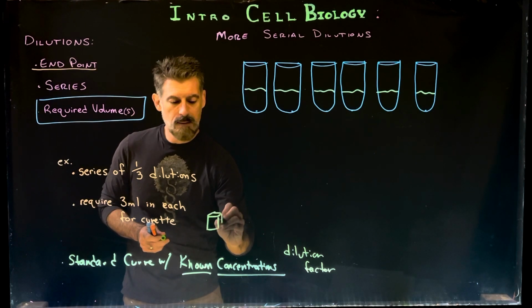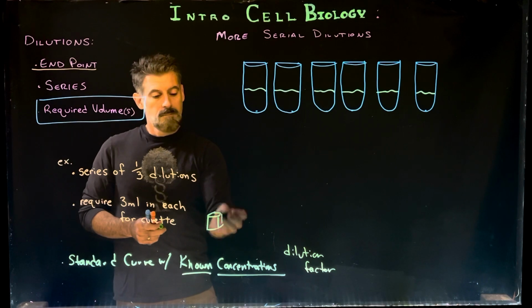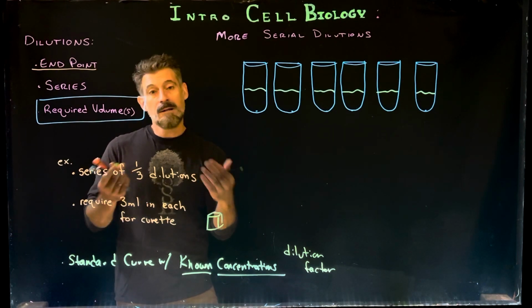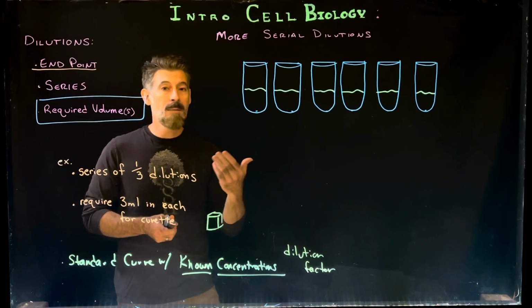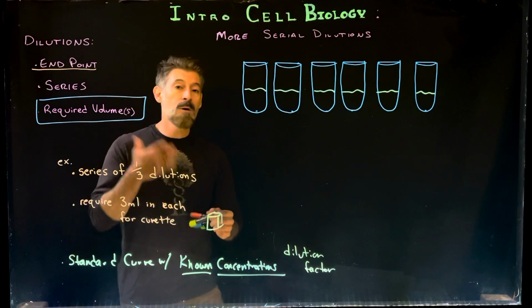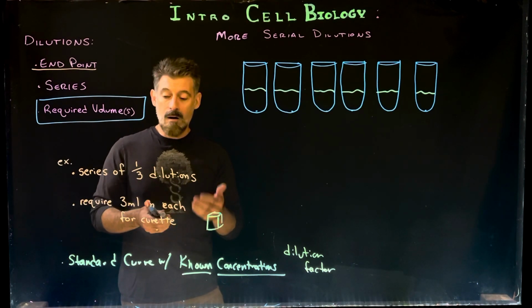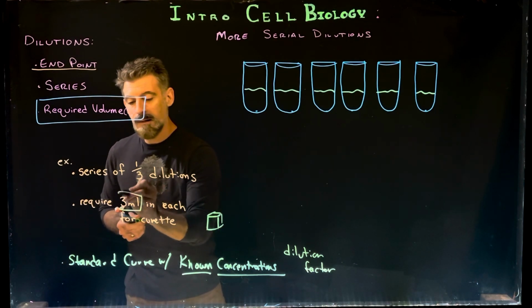The ones we use in lab are these little rectangular containers that hold liquid. You could get different types of cuvettes, and they might hold different volumes. Some may be called semi-micro and only hold 1 milliliter, or they could be micro and hold less than that. Generally, the ones that we use typically need about 3 milliliters.